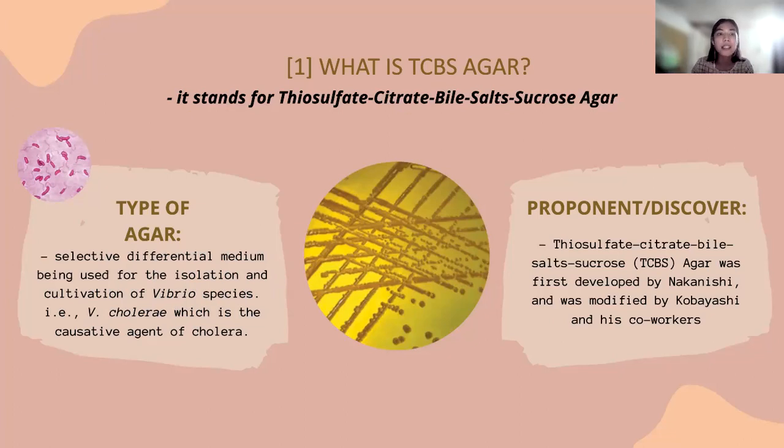We use this agar in the isolation and cultivation of microorganisms. In the laboratory, we use agar specifically to grow microbes, to culture them, and also to isolate them. We usually transfer them from one nutrient medium to another, so that we maintain them, because we use them in a series of tests.